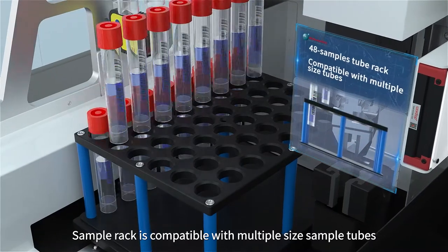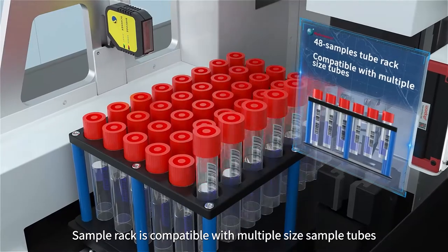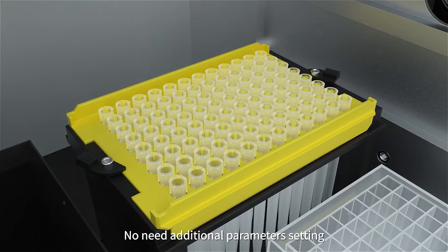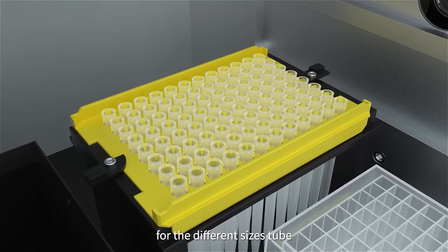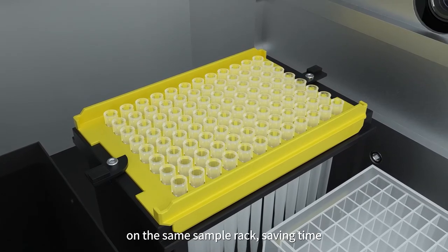Sample rack is compatible with multiple size sample tubes. No need for additional parameters setting for different sizes tube on the same sample rack. Saving time.